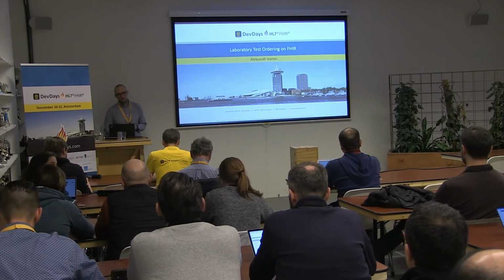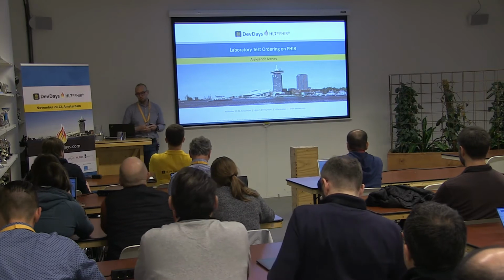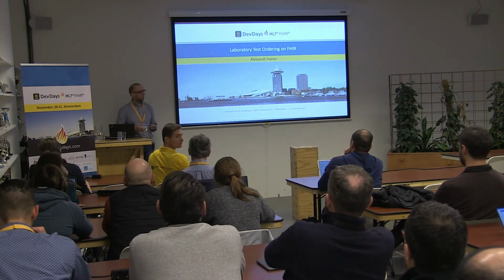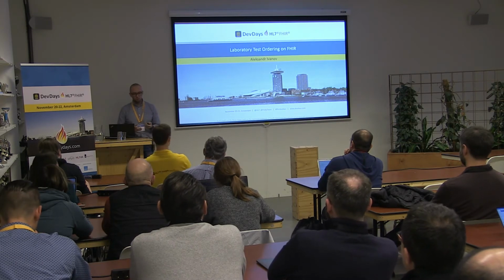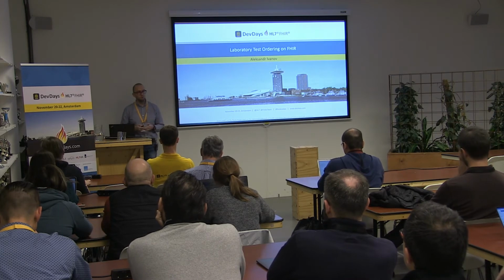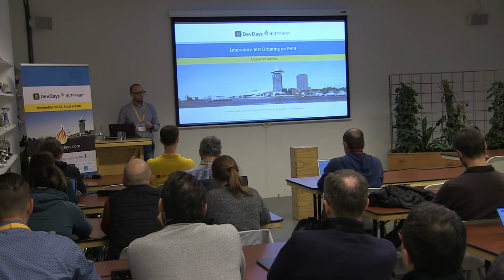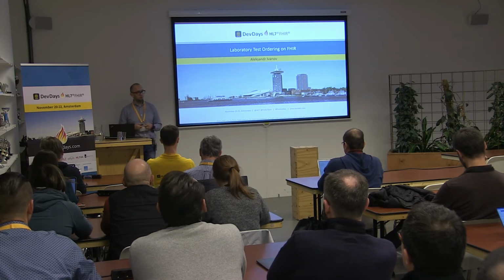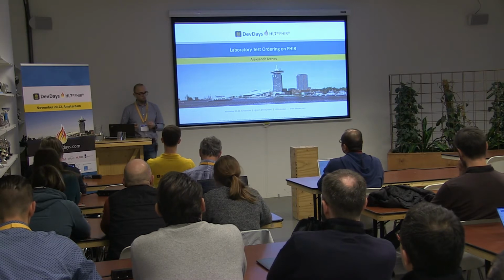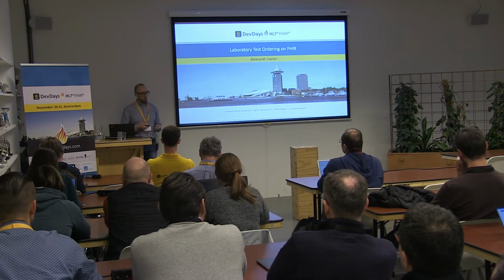Okay, my name is Aleksandr Ivanov, and I'll tell you about laboratory test ordering on FHIR. I'm a senior engineer at Medlin's company in Russia, and we have built FHIR-based solutions since version DSTU2. Our main customers are private laboratories who would like to have a real-time API to receive requests to make tests and to output results to their customers.